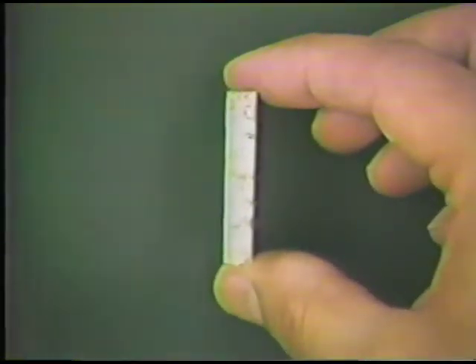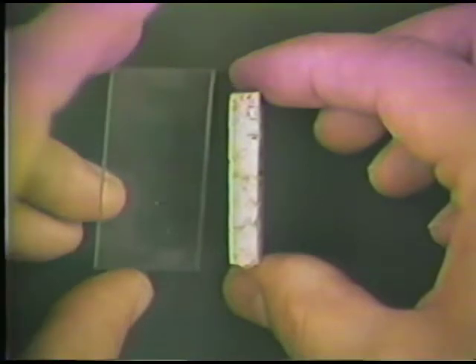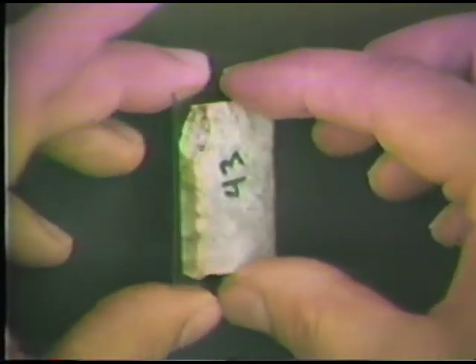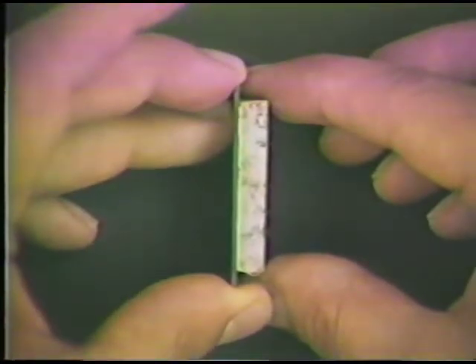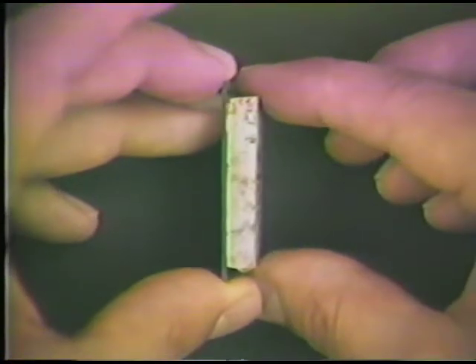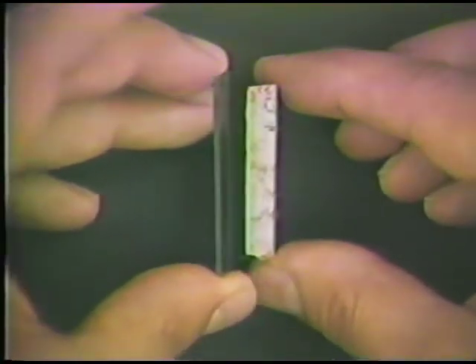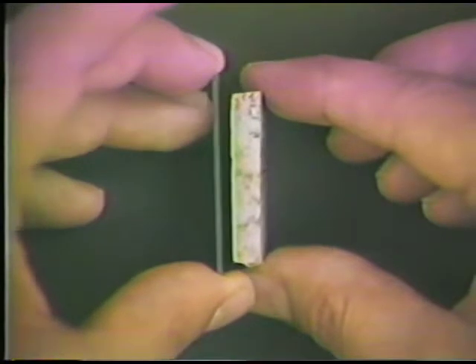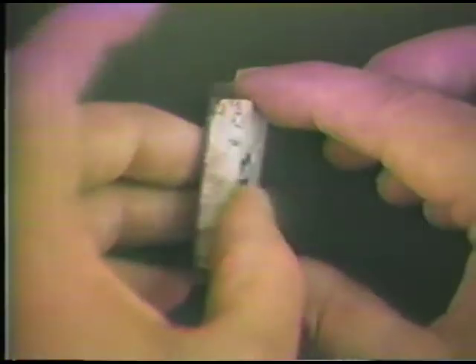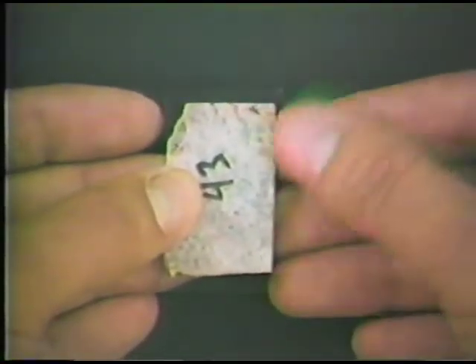If we're going to prepare it into a thin section, then we need a glass slide like this right here, and we simply glue the rock specimen onto the glass slide as a start in terms of the preparation procedure. Having a very smooth surface here, we use an epoxy to glue it on. There's in fact a little layer of epoxy between the rock and the slide itself. This material is glued right onto the glass slide, and then we begin to grind this surface until it becomes thinner and thinner.